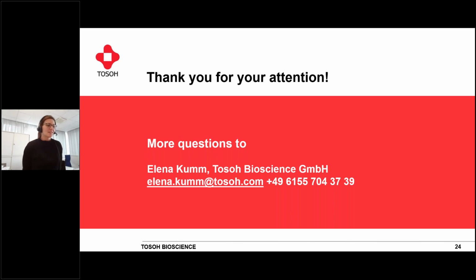It of course also depends. The really best method to use is the HPLC, because you don't need salt, and you have, for example, acetonitrile already in your mobile phase. Fc gamma 3A affinity is also working quite well with MS. In general, of course, you could also go for size exclusion chromatography, which is also used already, or ion exchange chromatography.